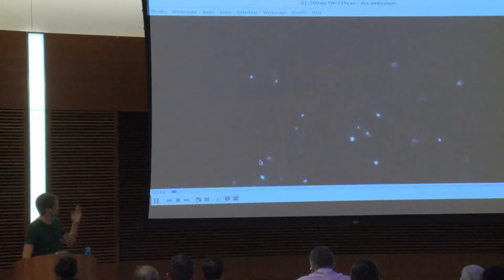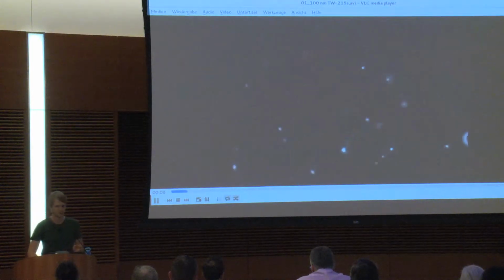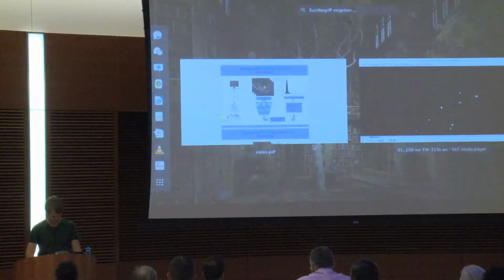These are polystyrene particles, 100 nanometers, diffusing in water. Okay, back to the slides.